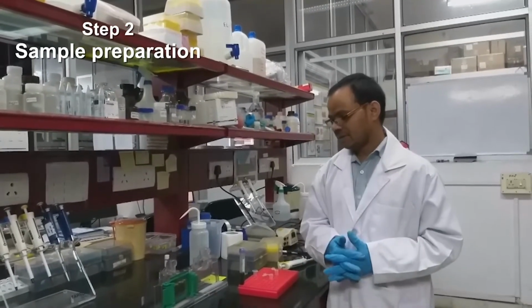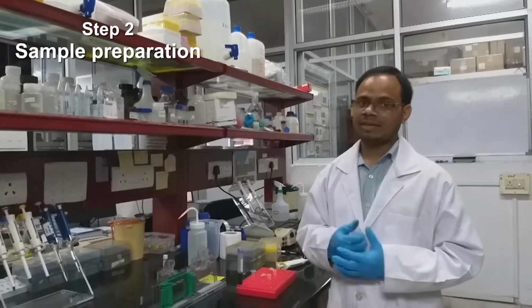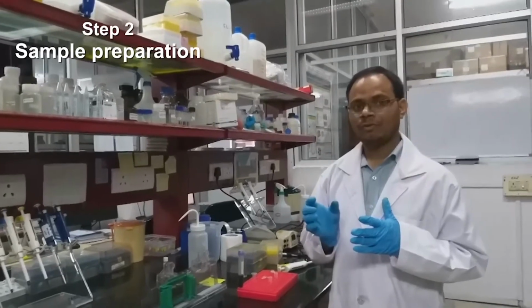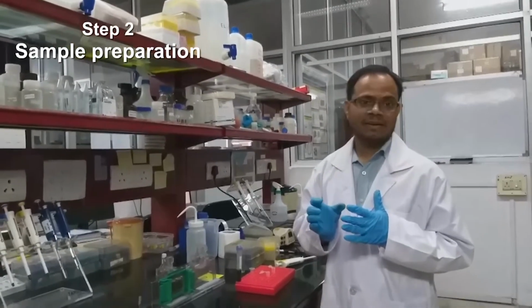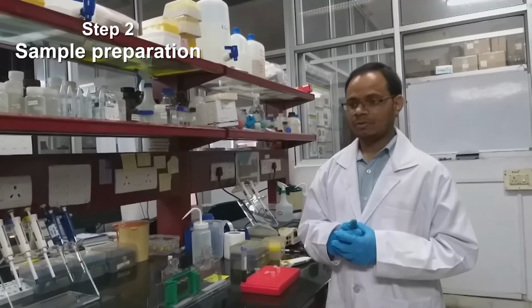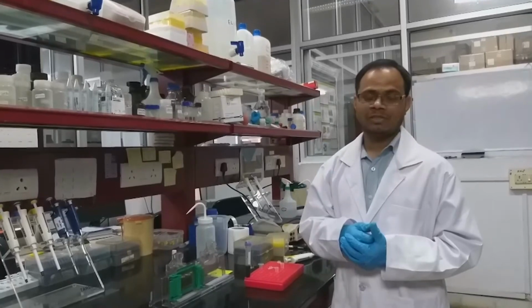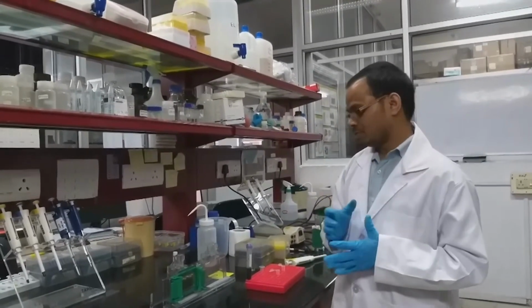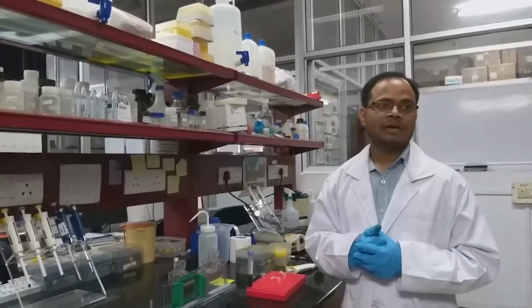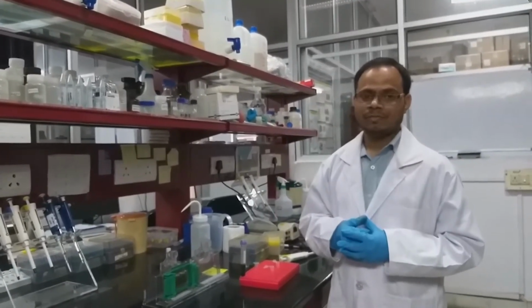The other thing is glycerol. While loading the gel, since the protein solution is not that dense, it may come out from the well. So in order to prevent this, we have to load with a denser solution like glycerol. So 30 to 50% glycerol is sufficient for keeping the protein solution intact in the bottom of the well. The other thing, bromophenol blue, we use just for tracking how much of the gel run is completed. So this is the loading dye.